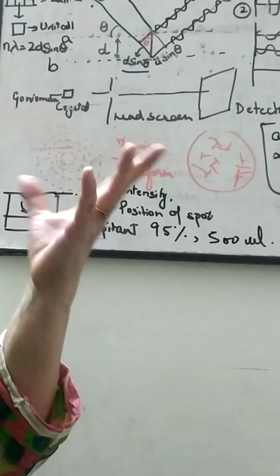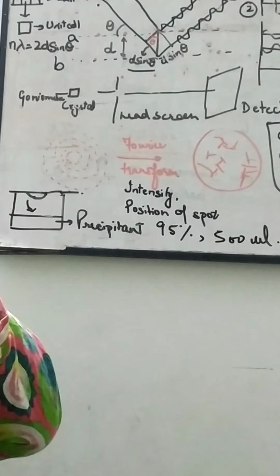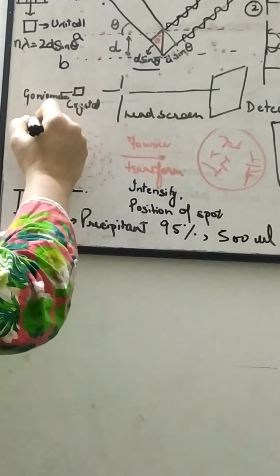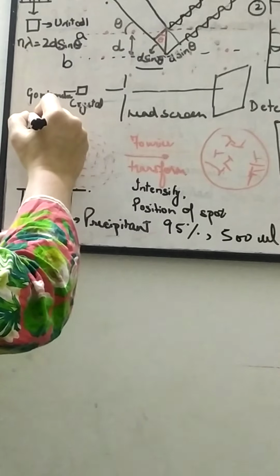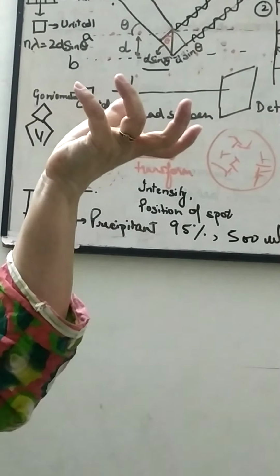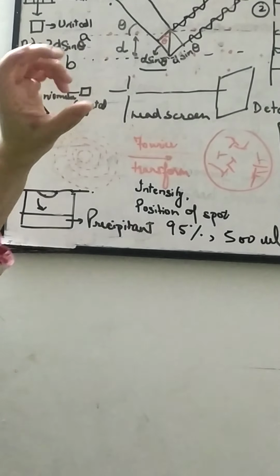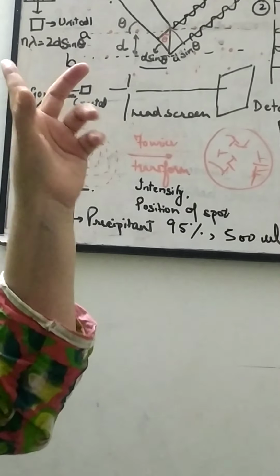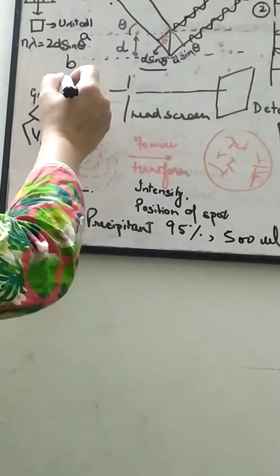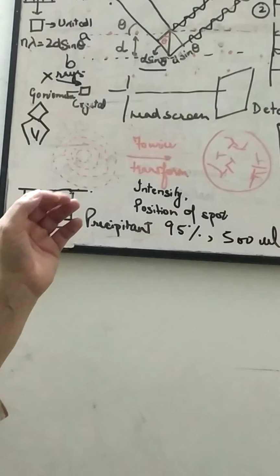If you have seen in certain movies, the goniometer is a kind of device. In the movies, you must have seen that the diamonds are placed on a device like this. Diamonds are placed and it keeps on revolving. So, it is around 180-degree movement, and the goniometer is the device which can move it like a spindle in all the directions. Why does it need to move in all the directions? Because X-rays have to fall on it.